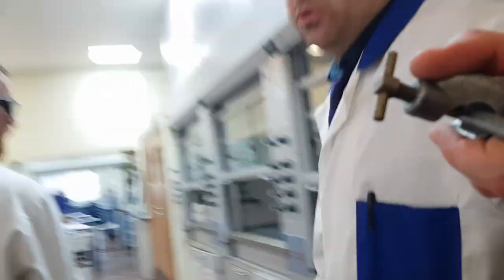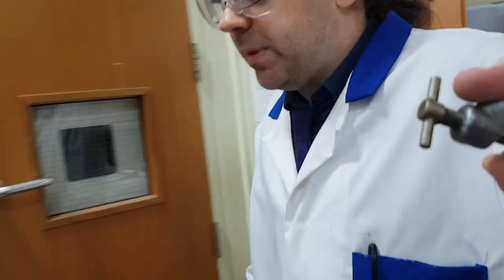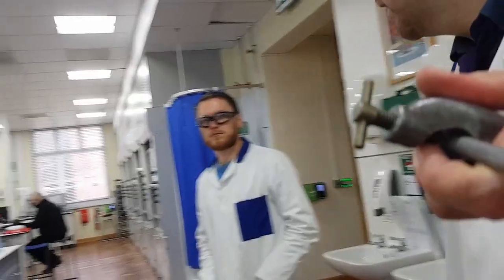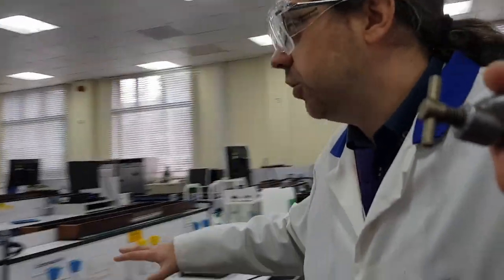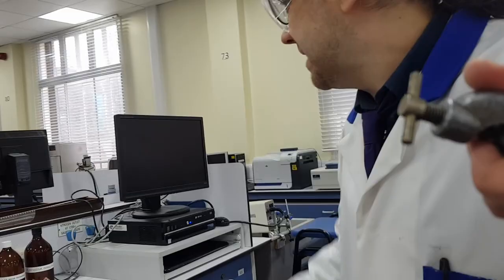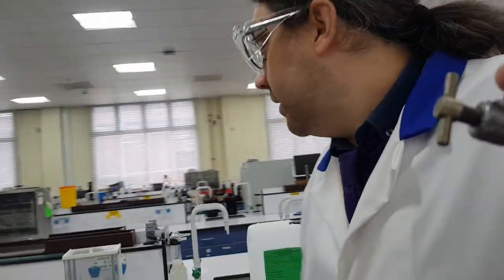Going to another one of our open bench spaces that we can set most of these up on. There's lots of spectrometers over here. Basically, any part of the electromagnetic spectrum we can scan through in the teaching. So we've got a teaching setup. One of the interesting things is we've actually got computers all set up in here as well, so you can log on. And instead of just writing and scribbling down all your results, you can tap them straight into a computer and do your writing up here as well, and access calculators, programs, extra software, all while you're doing the experiments.